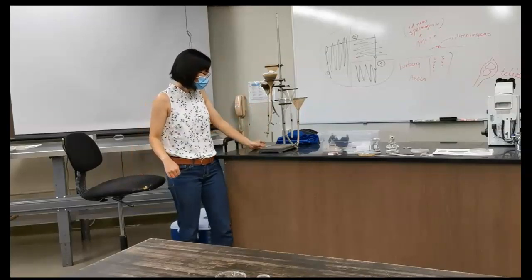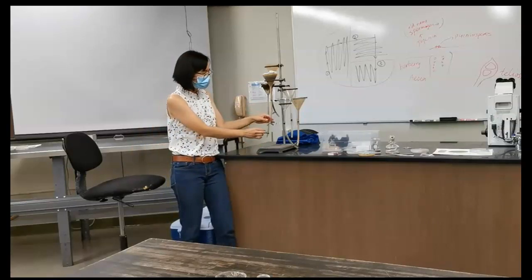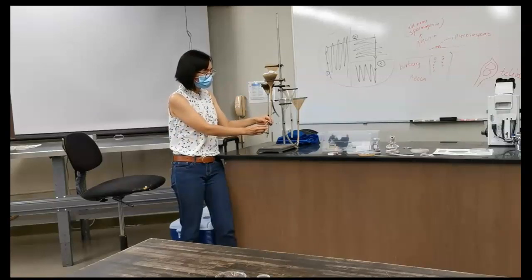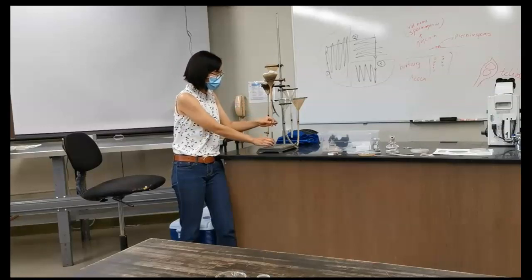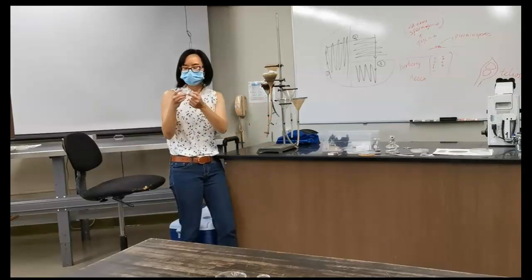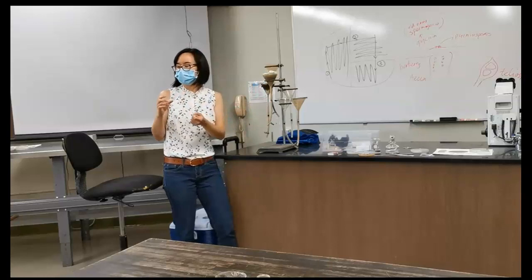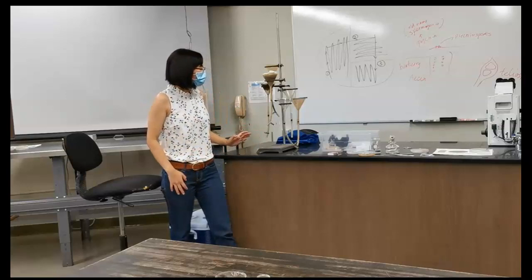And now I have the dishes, small dishes. You can put the dishes close to the tube. I can also help you with that, because if it's too high, then you can get water splashed everywhere. So just very closely, I can help you with that. And then carefully open the clamp and drop several drops of the water onto your dish, and then make observation with dissecting scope. So that's that.